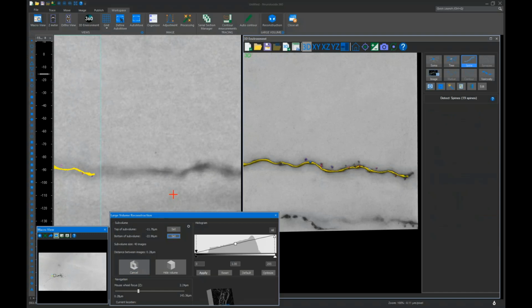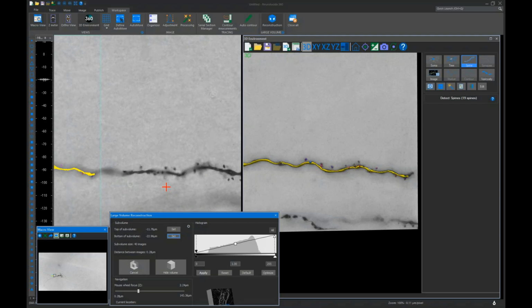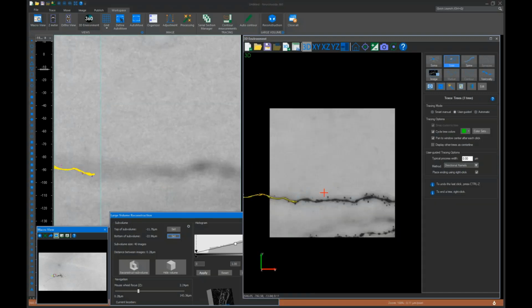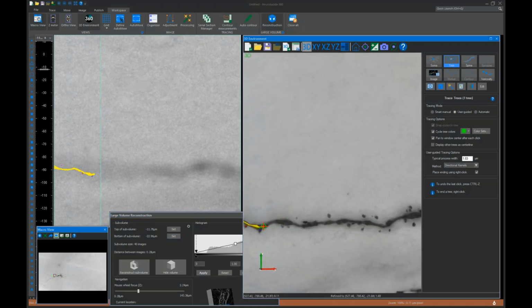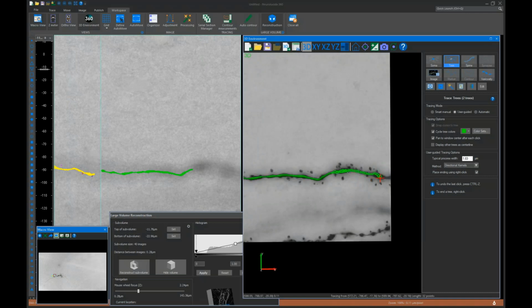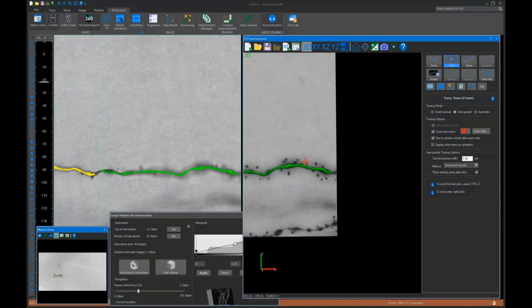You just want to make sure that when you're collecting that next subvolume, you want to go all the way through the structure so that it's out of focus, not just at the same region, so that you get a nice contiguous structure that you're looking to continue with completely available for reconstruction. And so you're basically going to repeat this process. So we are reconstructing this volume.